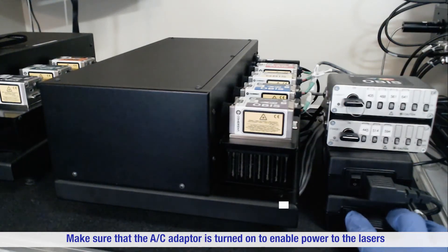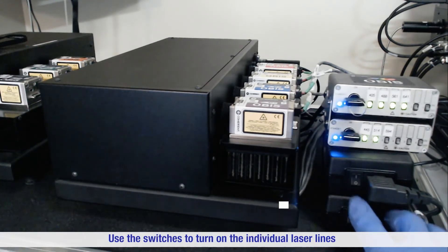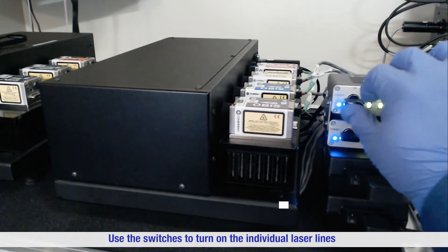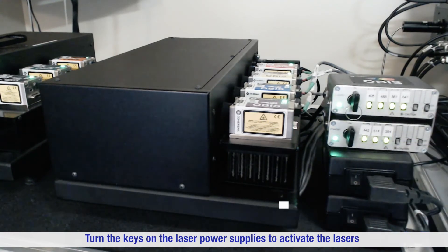Make sure that the AC adapter is turned on to enable power to the lasers. Use the switches to turn on the individual laser lines — the switches light up green when on. Turn the keys on the laser power supplies to activate the lasers.